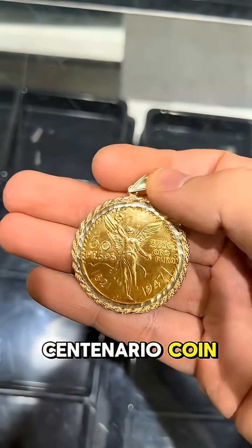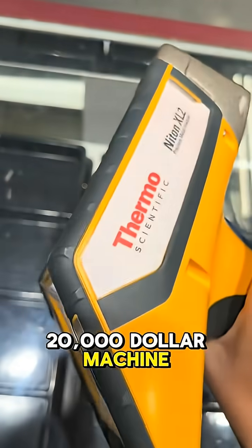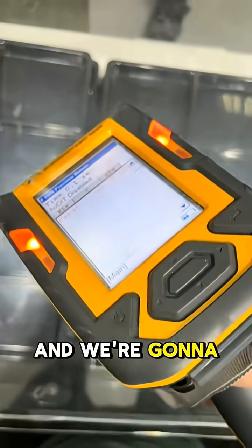Here is the Centenario coin. This is 10 carat. We have this $20,000 machine here, and we're going to scan it right there.